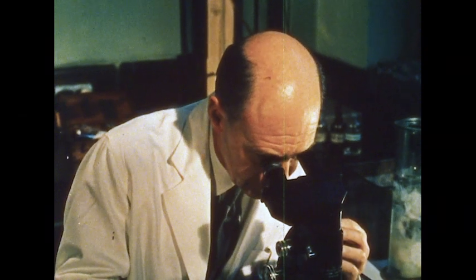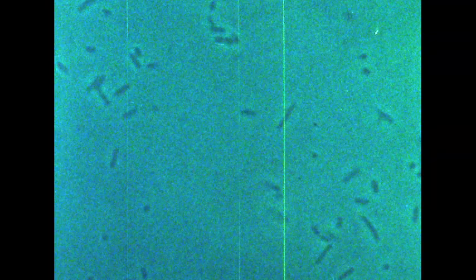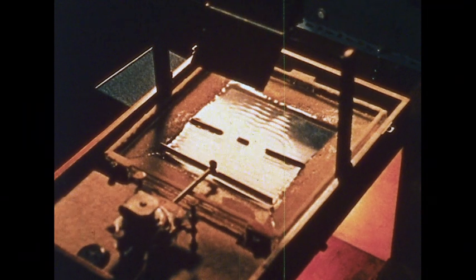Yet there is a limit to the detail it will reveal. Some objects are so small that they cannot be clearly seen. Others are too small to be seen at all. And this is due to the properties of light itself. The behavior of light waves can be simulated in water with a ripple tank.